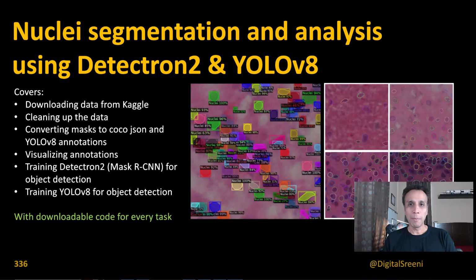Hi everyone, welcome back. I hope you are ready for a long tutorial on nuclei segmentation. This is going to be a mega project or a large project, let me put it that way. And our goal is to perform all the tasks on the left-hand side that you see on the screen. We are going to do a full project where we start from nothing, download data from Kaggle.